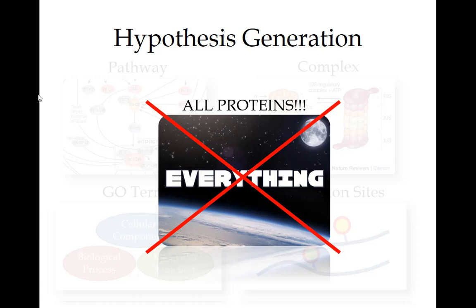And the reality is, if you just take a FASTA file and you digest it, and then you look for every single one of those peptides, we know based on how mass spectrometry works that a lot of those peptides might not ionize well, they might not be detectable, they might just have a ton of interference, so you won't see them. So you kind of want to narrow your list down. But I know that a lot of times when you're digging into a DIA data set, you might not really have a hypothesis yet. It's hypothesis generating data, so where do we even start?